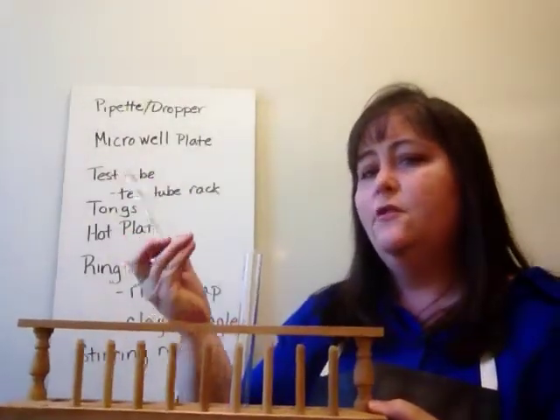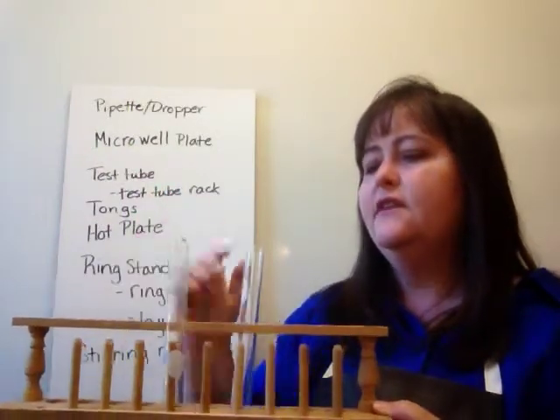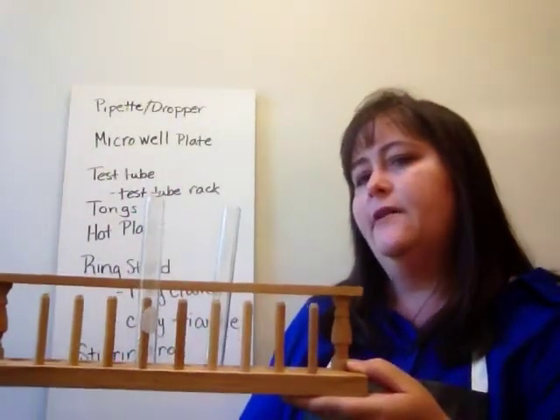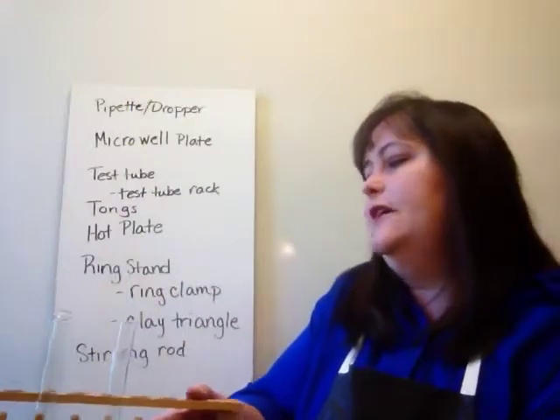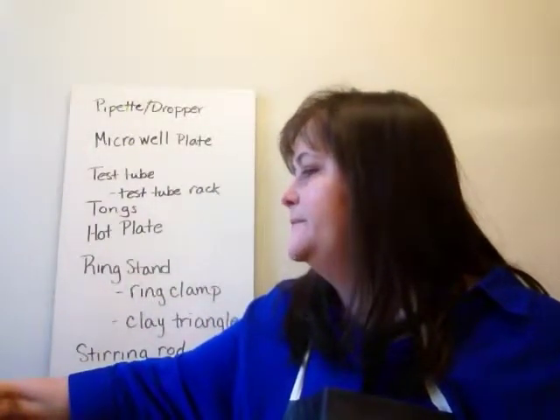And when you're finished, you wash your test tubes and you turn them upside down. You can see this is a washed one just recently. And that's where you put them to dry. Once they're finished drying, you can put them back upright in the test tube rack and use them again.